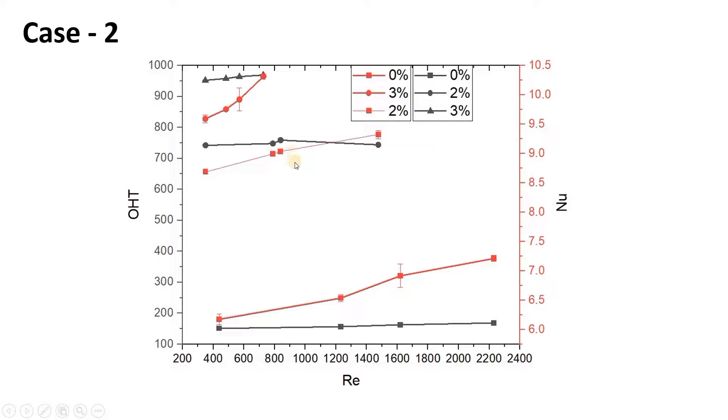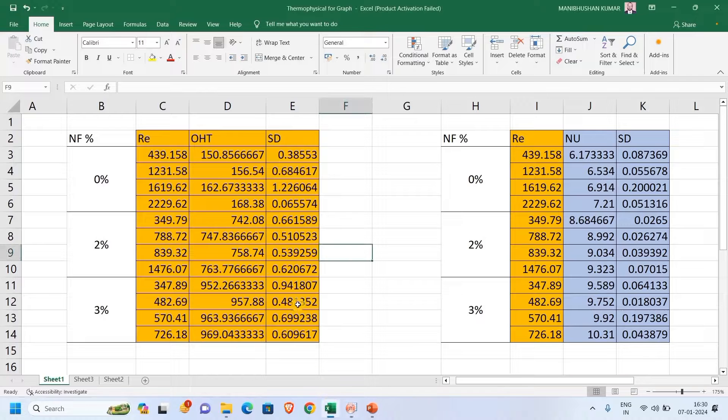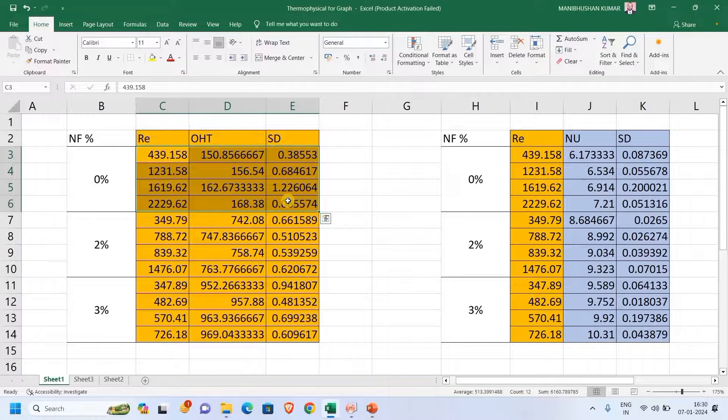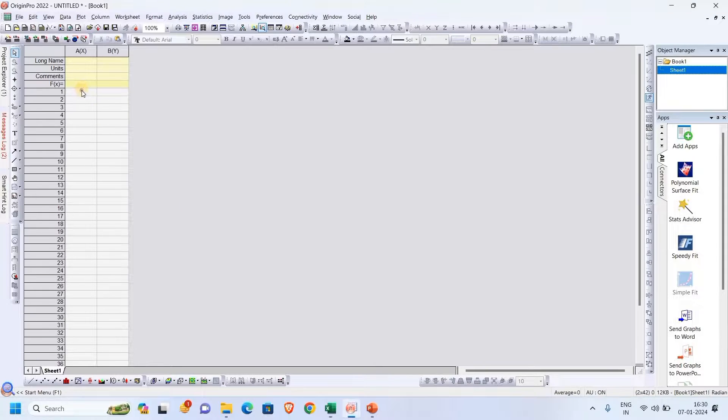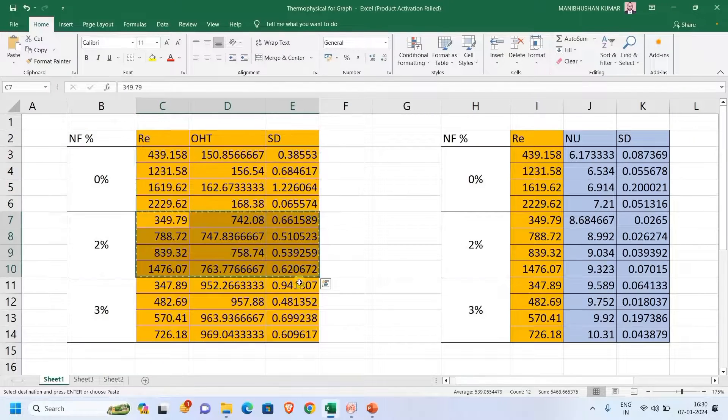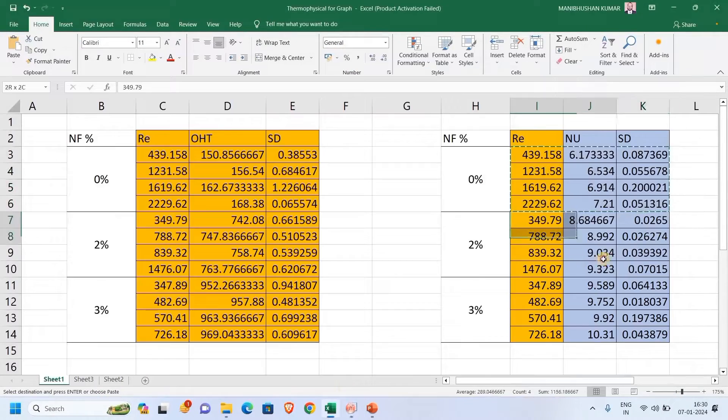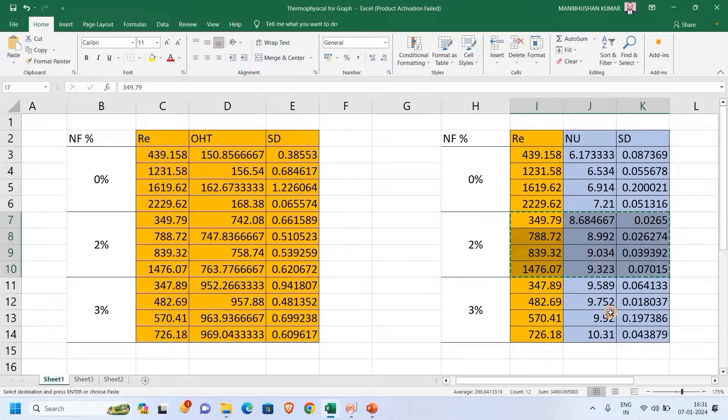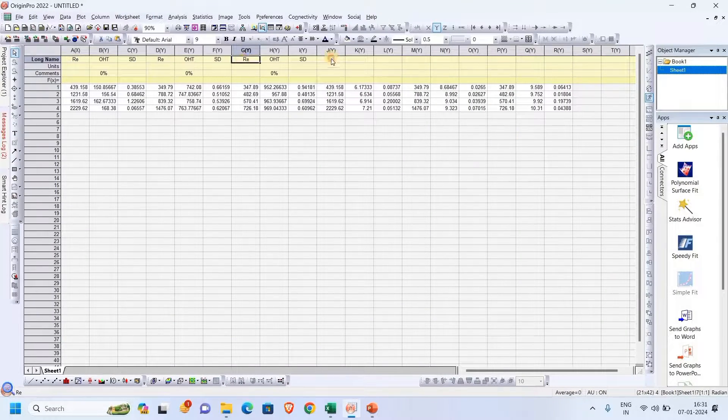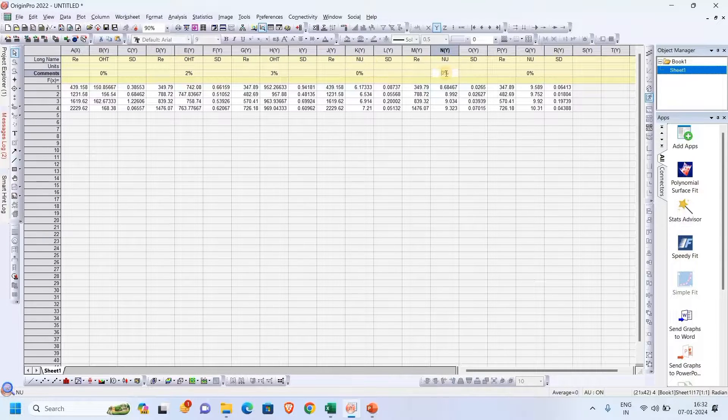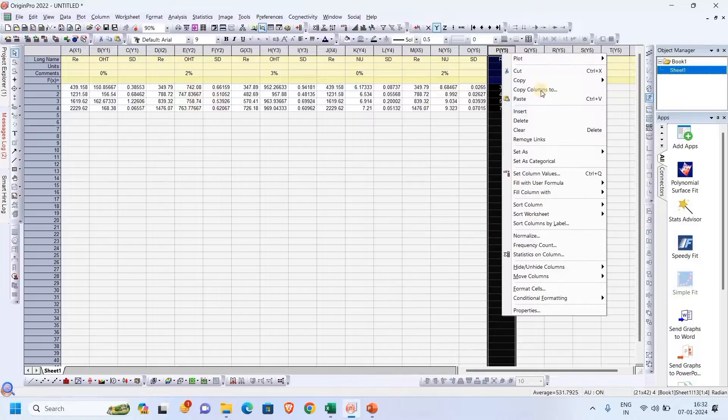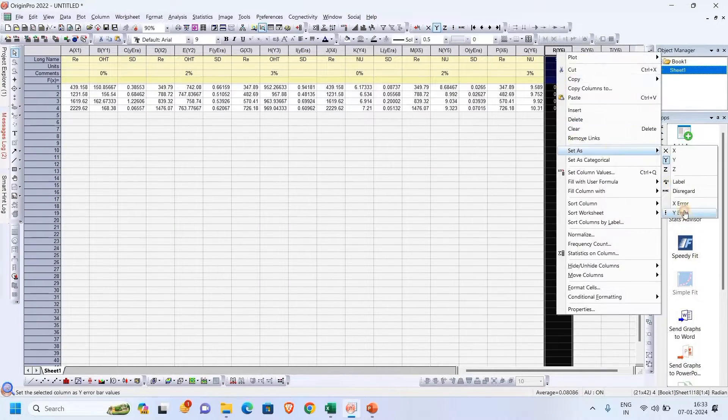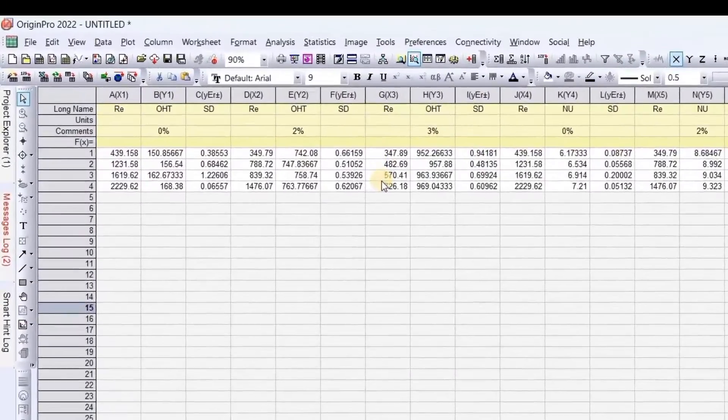This is a bit complex while plotting, so we will plot this graph in Origin. We will copy-paste all the data accordingly. Okay, I have set all the data now, and let me remove this extra one.